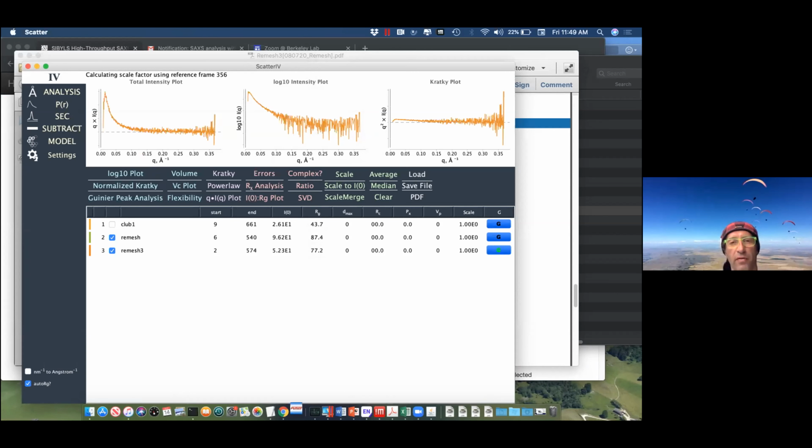It's a more advanced program that we're going to discuss through our workshop in August. It can deconvolute the different peaks. If the peaks are very close to each other, we can use multiple SAXS frames and singular value decomposition to deconvolute the different species under those two peaks.